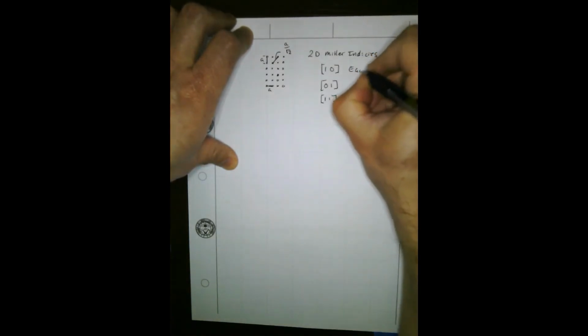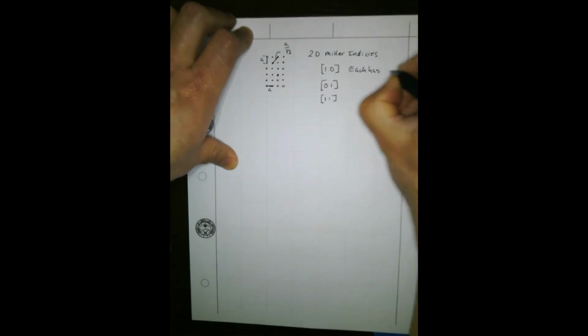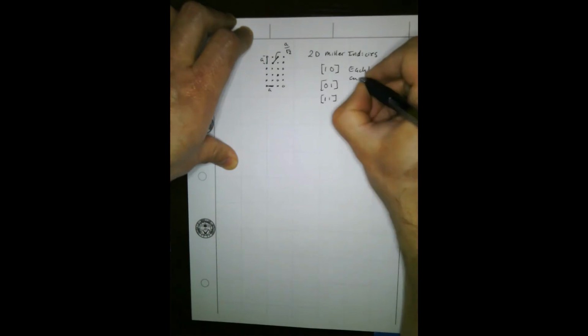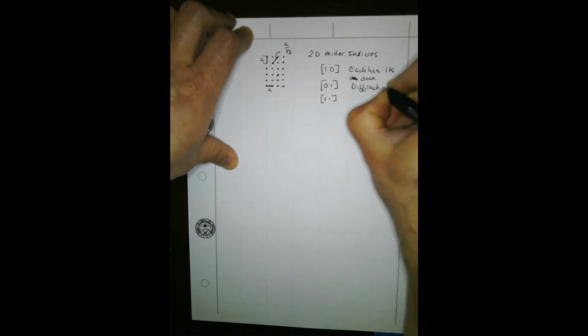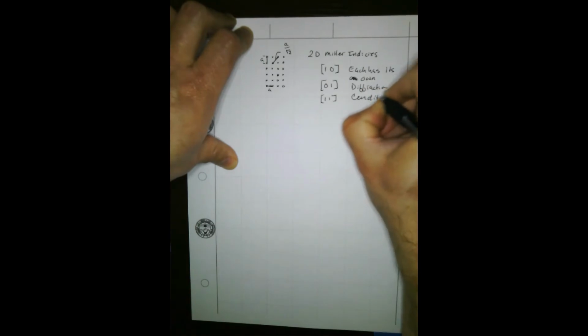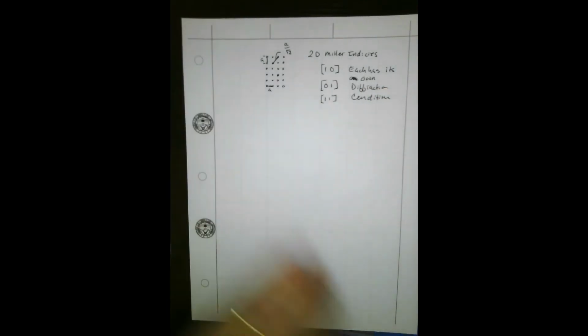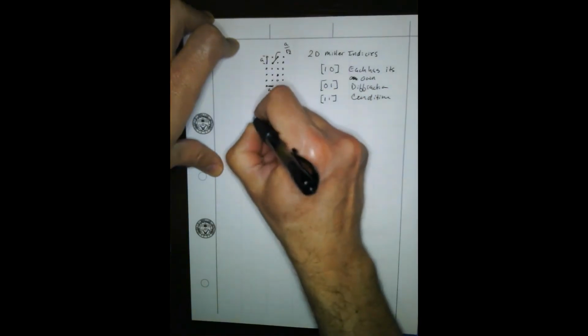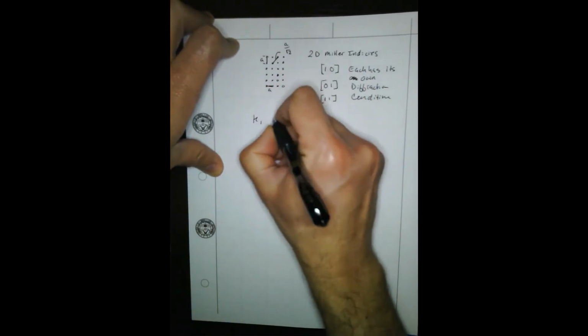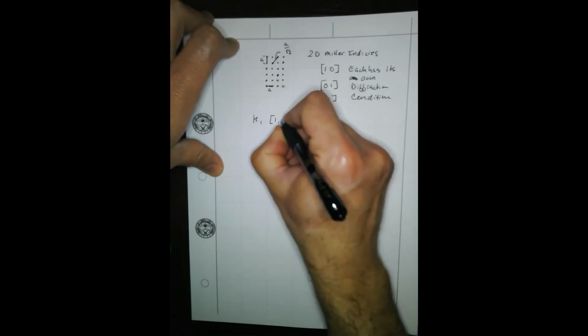Each has its own diffraction condition. And we see this in the XRD all the time in 3 dimensions, right? So we know where peaks lie. 111 is generally an early peak on the spectra. So try to imagine that. We have different k vectors associated with each one. So we can denote this one k vector 1, and this one will be for 1, 0.